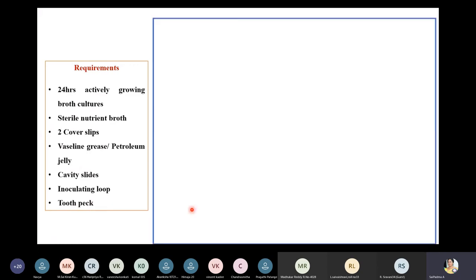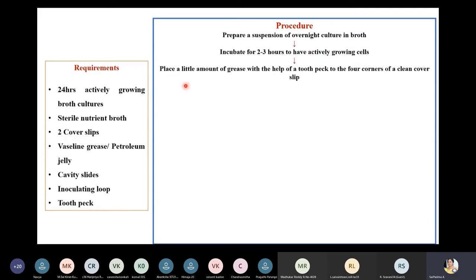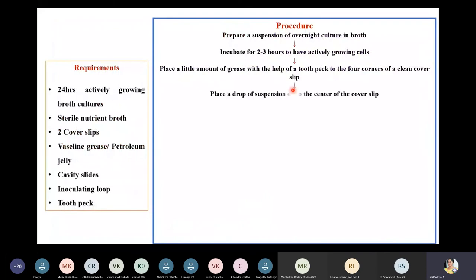For the procedure, first prepare a suspension of overnight culture in broth, then incubate it for two to three hours to have actively growing cells. Next, place a small amount of grease using a toothpick to the four corners of a clean cover slip. Then place a drop of the suspension containing actively growing cells onto the center of the cover slip.